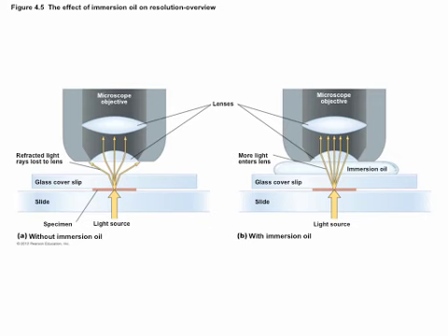So it's going through the glass here, and it gets bent a bit. And then it goes back into the air, and it gets bent more. And then it goes into the lens here, and it's going to get bent again. And some of the light is going to escape. It's not going to hit the lens because it's been bent so much. The difference between glass and air is much bigger than the difference between glass and oil.